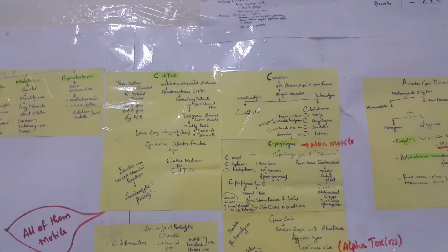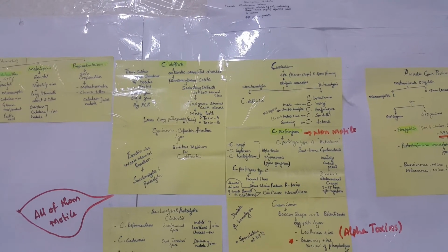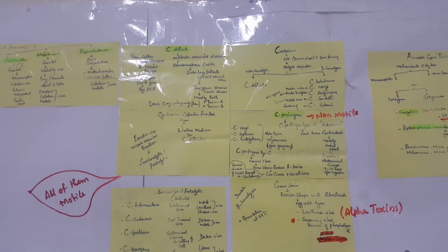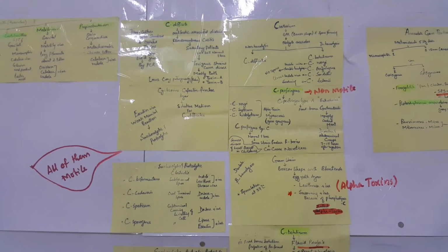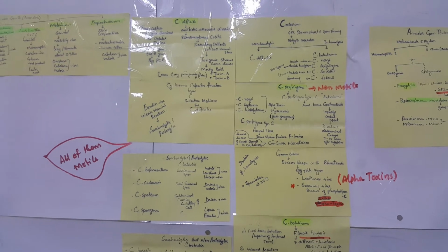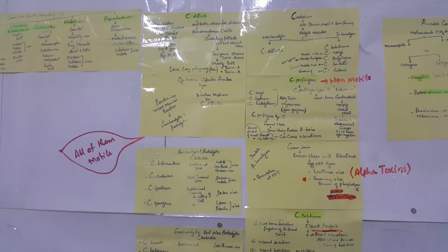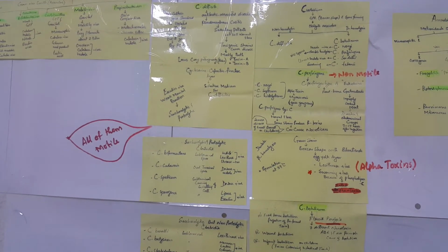Clostridium species. Clostridium is a gram-positive rod with boxcar shape and spore-forming ability. They are obligate anaerobes. The only species in Clostridia that is non-hemolytic is Clostridium difficile. All other species are beta hemolytic: Clostridium botulinum, novyi, perfringens, sordellii, tetani. All these species have some different characteristics, like tetani can swarm, and sordellii is positive for urease and indole, and perfringens shows a double zone of hemolysis. Novyi is indole negative. There are no spores for perfringens.